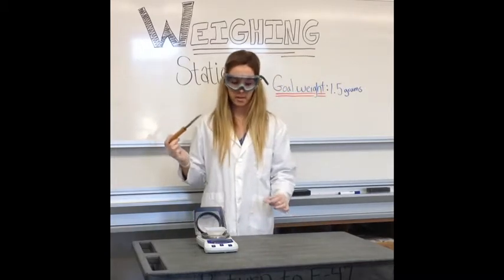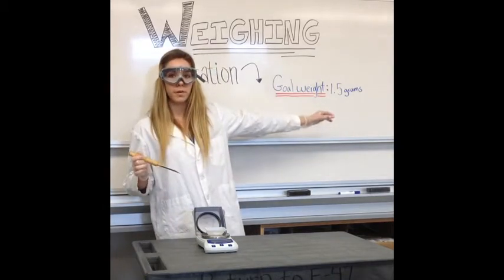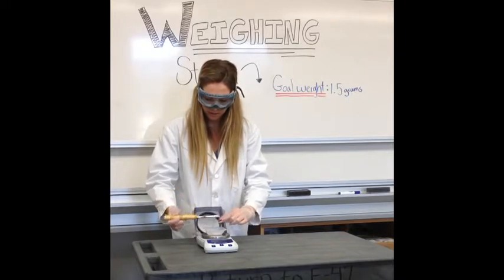This is our spatula, and we're going to scoop in our ideal weight here, which is 1.5 grams. We need to make sure that while we're doing this, we don't put over 1.5 grams, because it is very difficult to reverse that process.